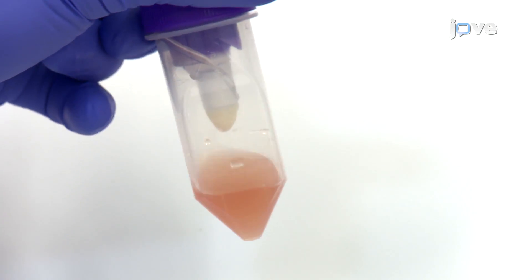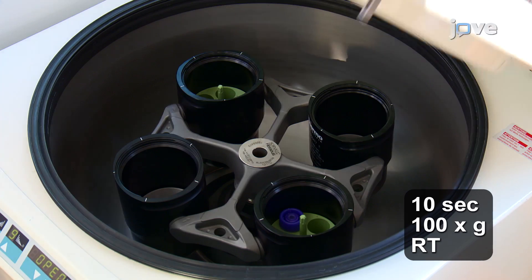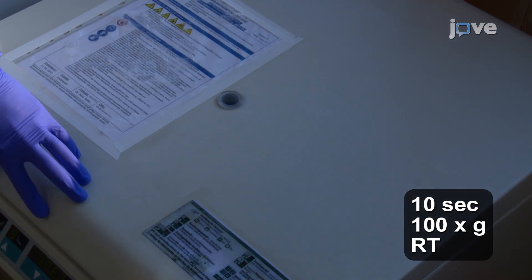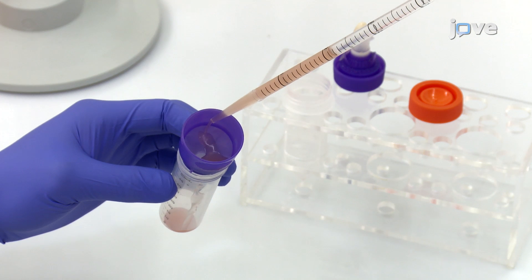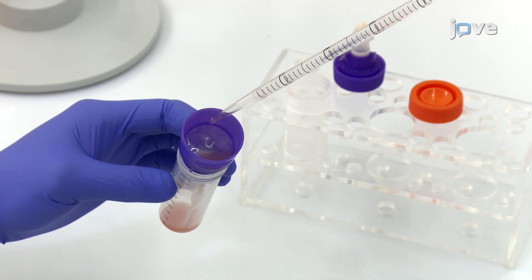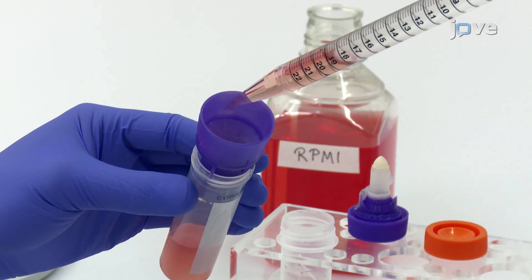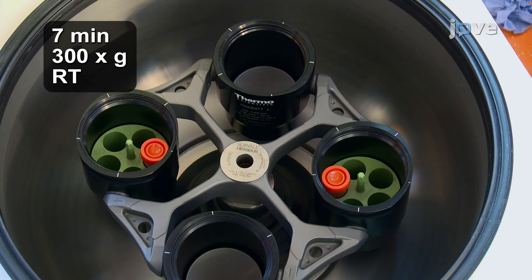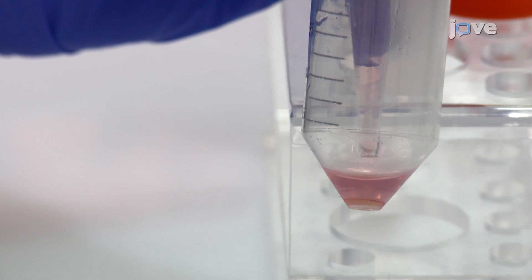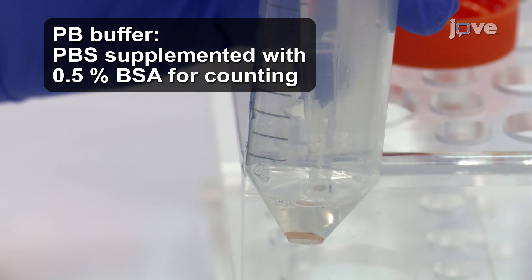When a single cell suspension has been obtained, quickly centrifuge the tube to collect the cells at the bottom. Filter the cells through a 70-micron mesh strainer into a 50-milliliter conical tube and rinse the strainer with 20 milliliters of medium, collecting the wash in the sample tube. Then centrifuge the cells and re-suspend the human tumor mouse stromal cell pellet in 5 milliliters of PB buffer.